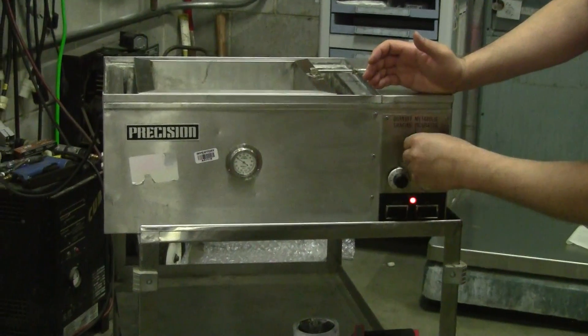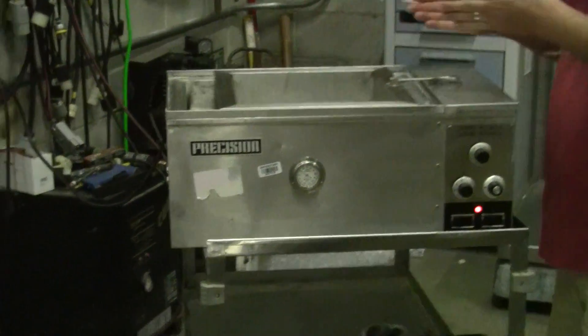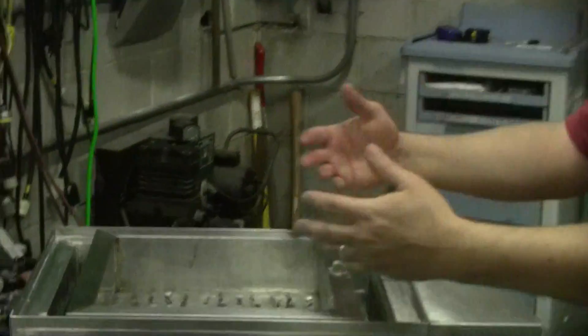There's a motor control switch that changes the speed at which it oscillates. It's reciprocating back and forth, not orbital back and forth.